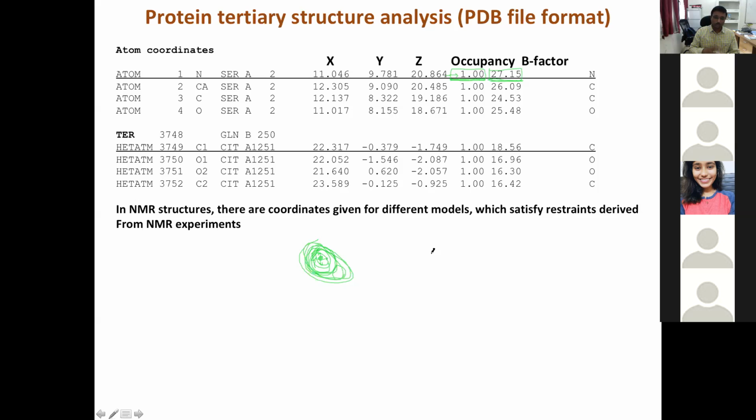In fact, a lot of studies have tried to correlate the flexibility of a protein by looking at the B factor. Lower the B factor is, more rigid the structure is. So if I'm looking at a particular protein structure and want to understand what part of it is flexible in comparison to other parts, not comparing to another protein, then you can use the B factor. Regions with a very low B factor you call rigid regions. High B factor regions, you call flexible regions.